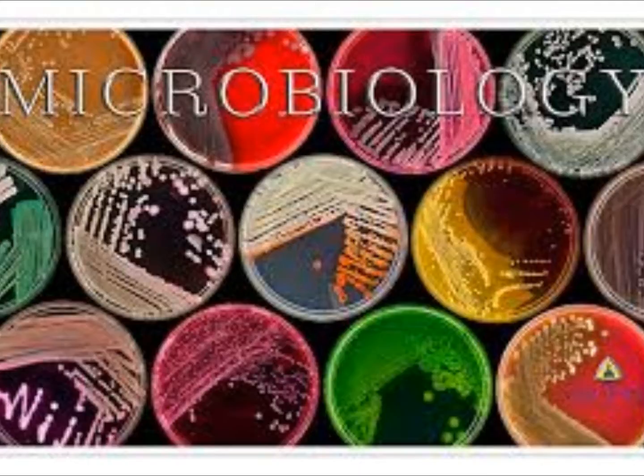Waxy, you'll see that with some of your Bacillus species, that they just fall apart like wax. Like if you have a candle that melted and you go to knock the wax off, and how it just breaks up, that's how that does. And sticky. A lot of the Micrococcus are real sticky. When you go to pick up a colony, to streak it to a plate or to make a gram stain, that entire colony will just pick up and stick to your loop.